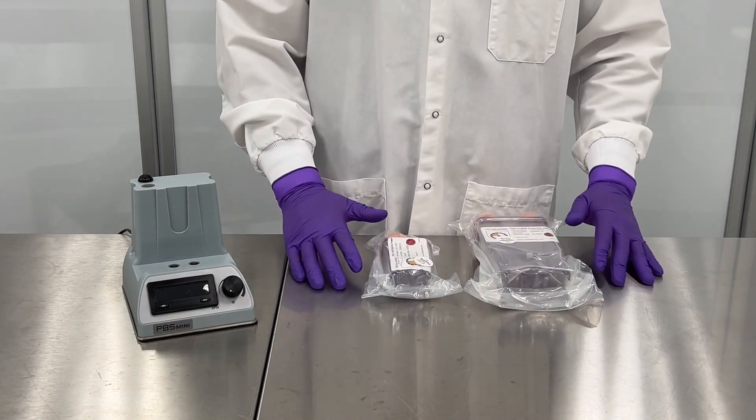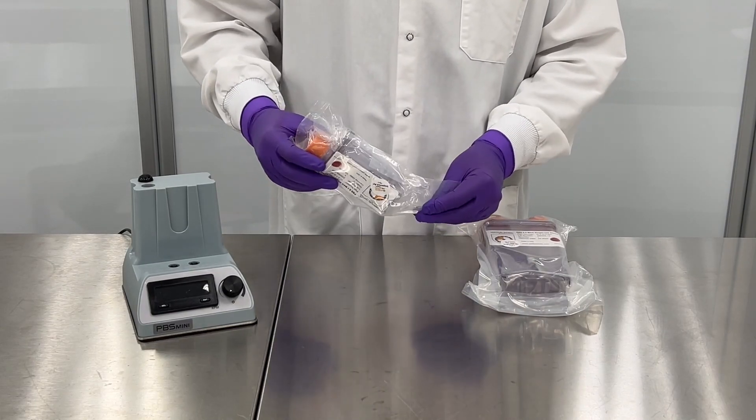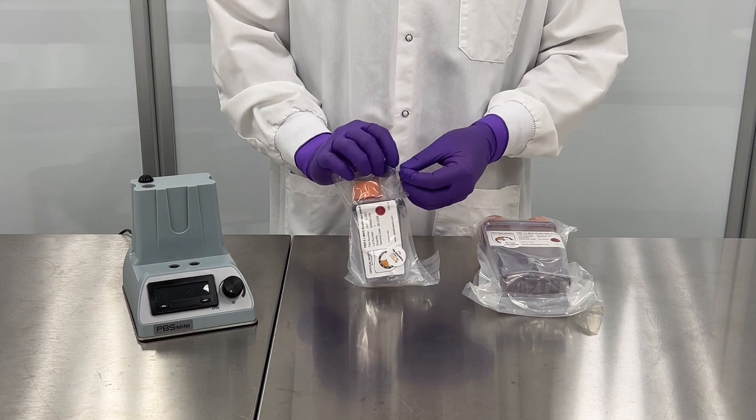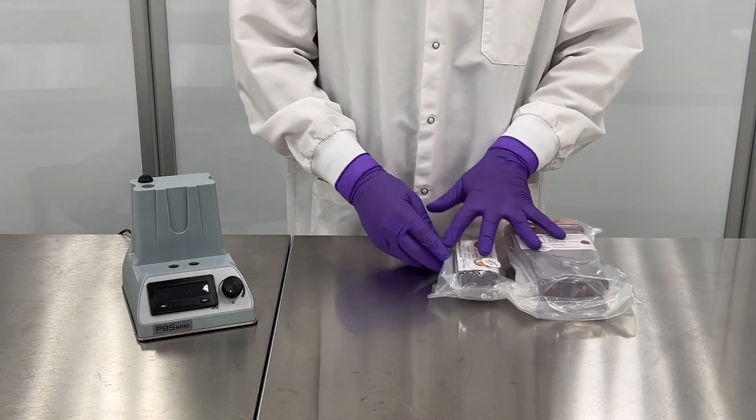Here we have some samples of our 0.1 and 0.5 vessels. You can see they come pre-gamma sterilized and they're double bagged. To open these you would just grab a hold up top here at the pre-cut, pull it out, and then that would allow you open this without any scissors or any sharp elements.